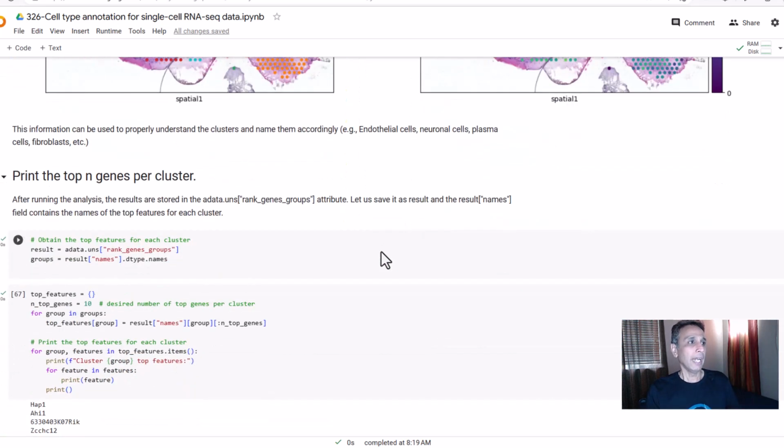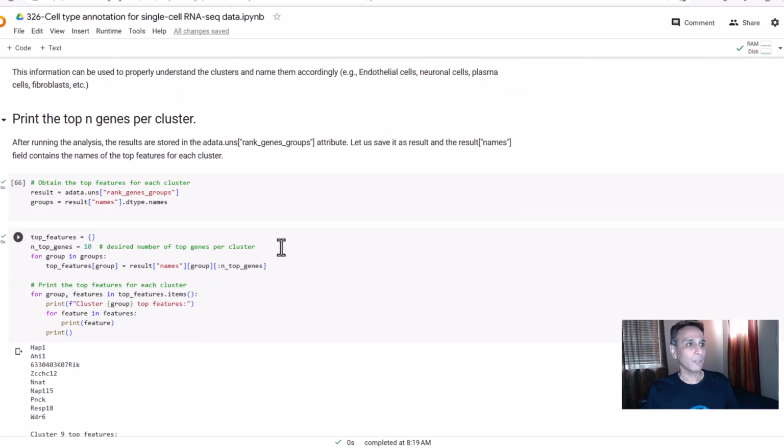Okay. Now, we are almost getting to the starting point of what we want to do. I promise it's not going to be a very, very long video, but we are getting there. These steps are very important, at least for us to understand, so we know what the starting point is.